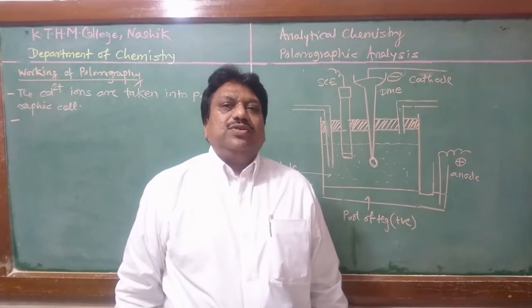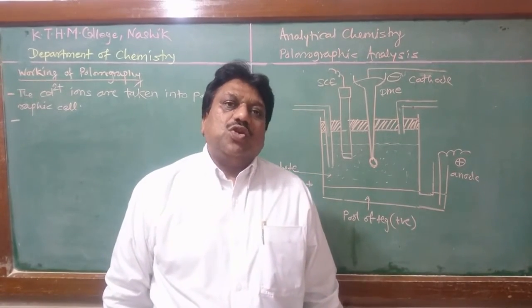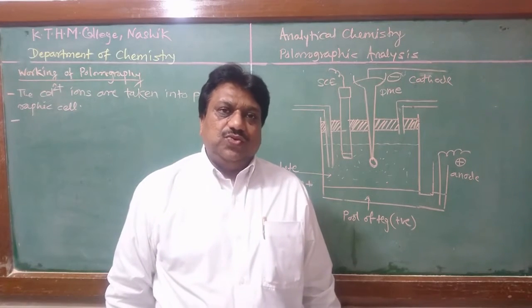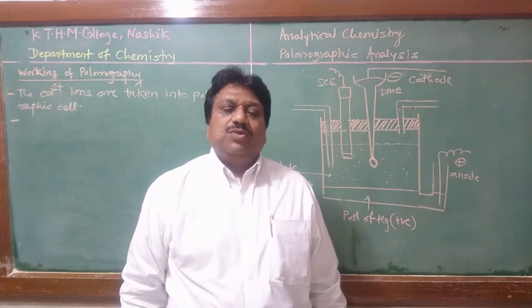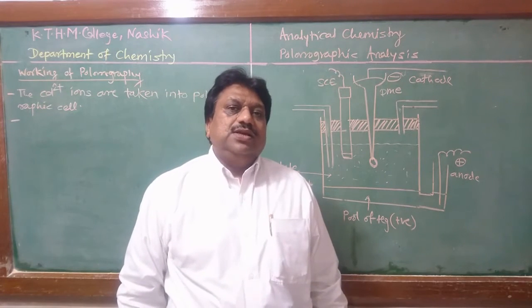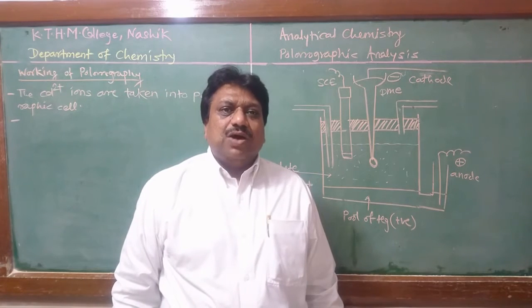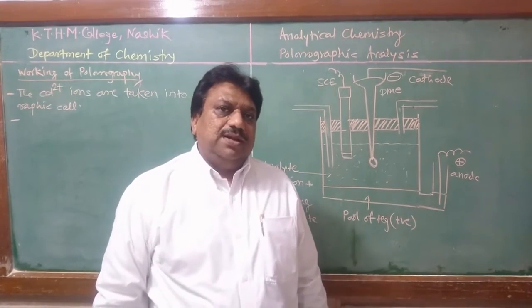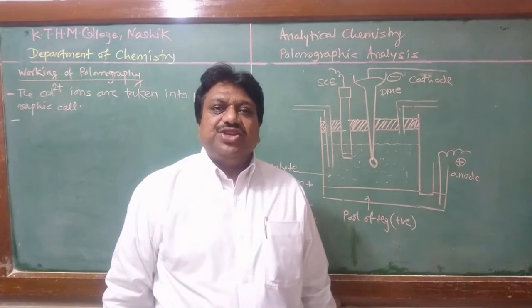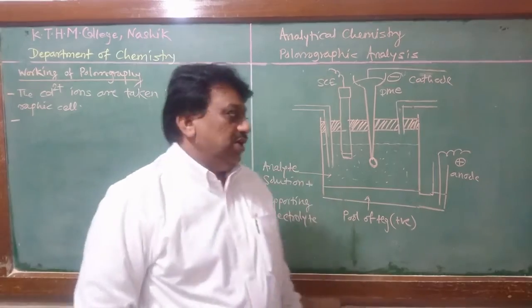Therefore, in polarographic analysis it is essential to remove the dissolved oxygen from the analyte solution, and it is done by bubbling nitrogen gas into the analyte solution. Nitrogen gas expels the dissolved oxygen from the sample, and nitrogen gas is very inert, so if present in the solution it does not affect the measurement.